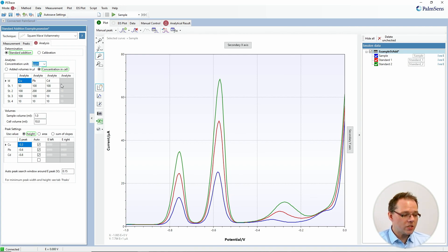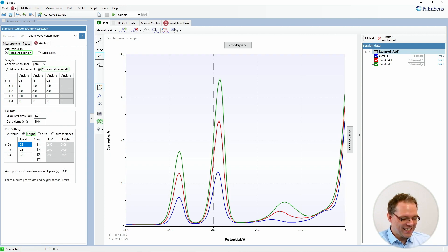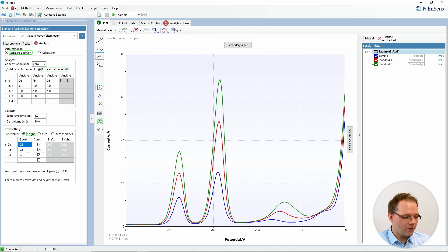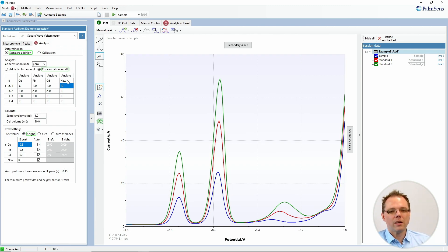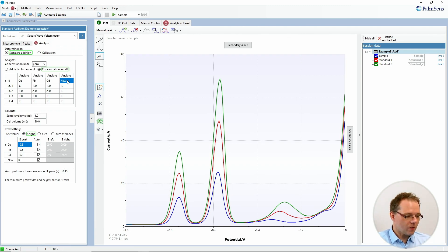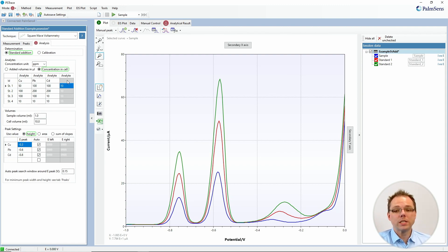If you want to change analytes, you need to double-click it and you can change the name to something else. When you're done you just press Enter. This way you can also add a new analyte by typing a new name, which unlocks the full column. If you don't want it, just empty that field and the column is blocked again.